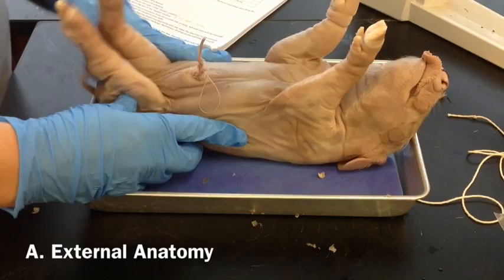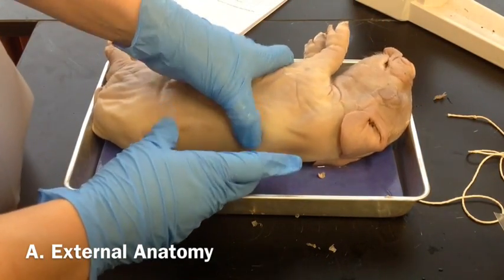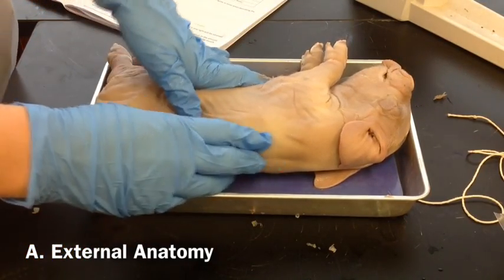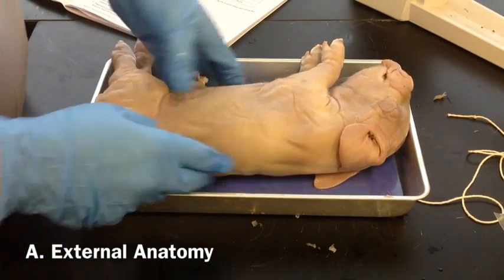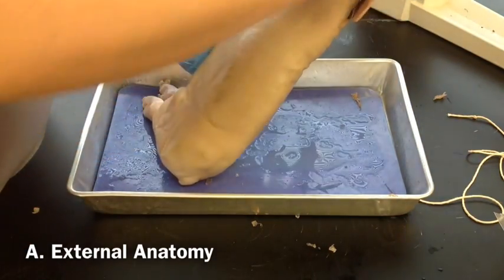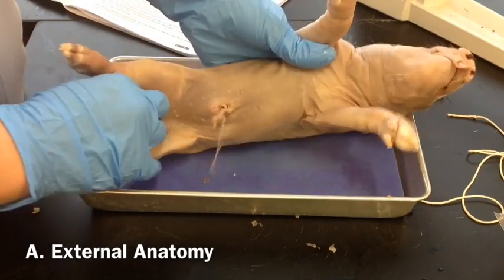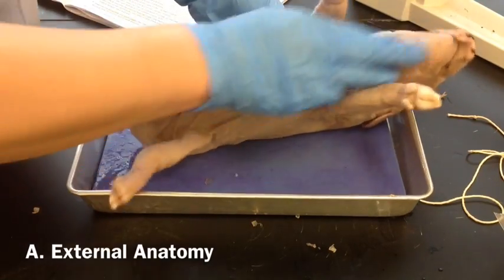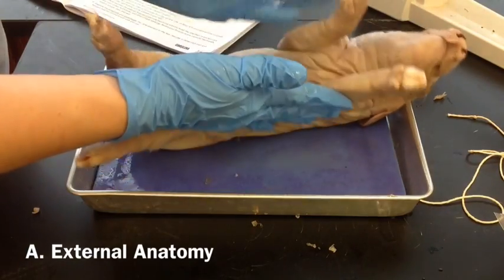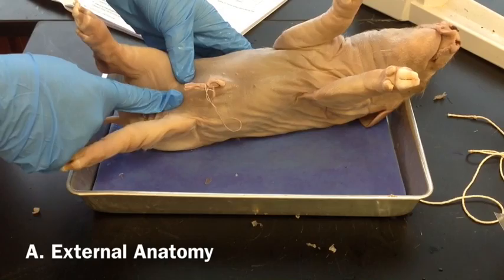After we measure the length, we're going to examine the external anatomy — this is all Part A in your dissection manual. Make sure you understand the different anatomical terms. Dorsal means towards the back. Ventral is on the belly side. Anterior is towards the head. Posterior is towards the tail. Lateral is on either side. Medial is towards the midline — towards the middle of the pig.